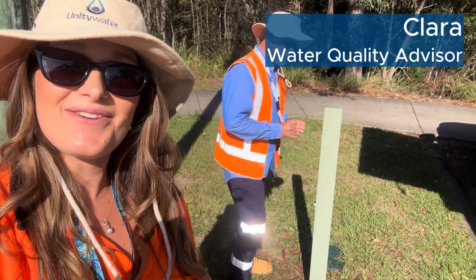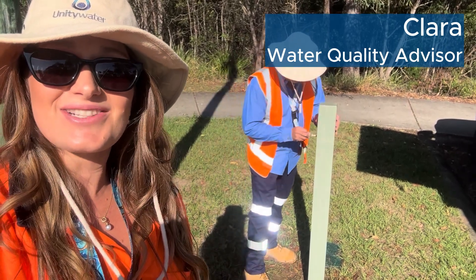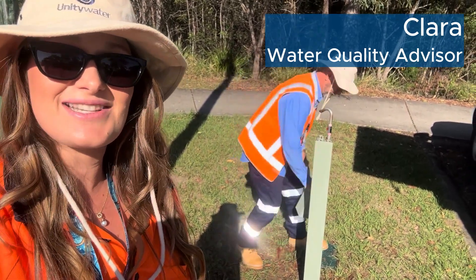All right, first up I'm here with Ken from the sampling team who's going to show us how to take a water sample from our specially designed sample taps.